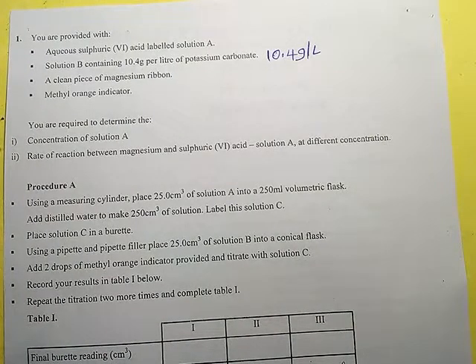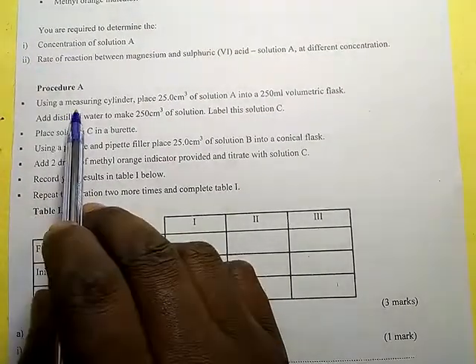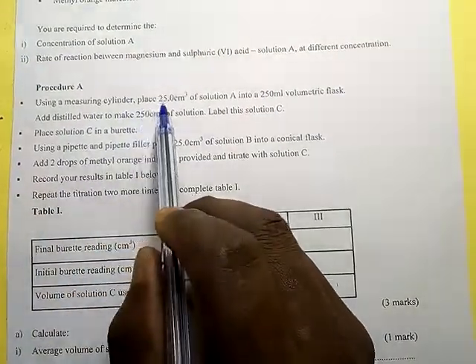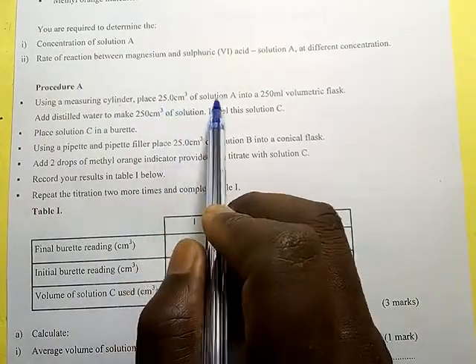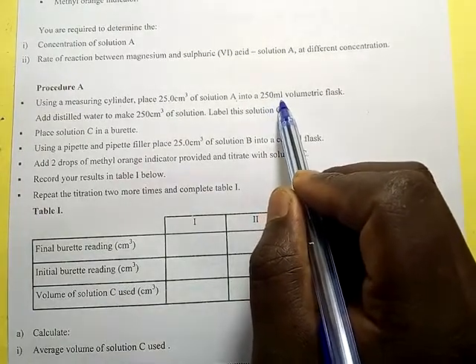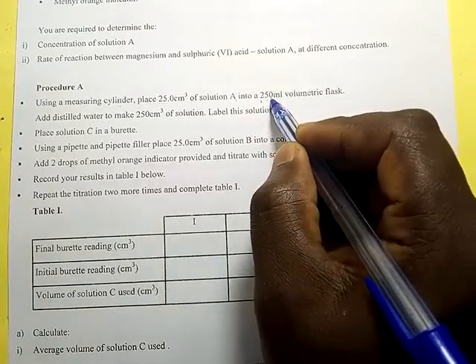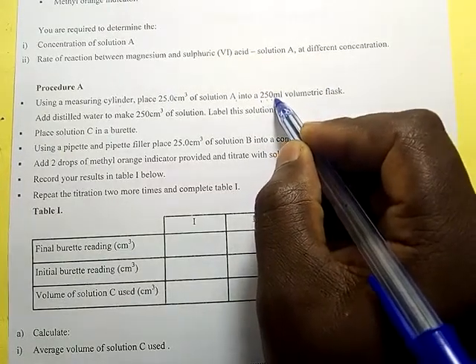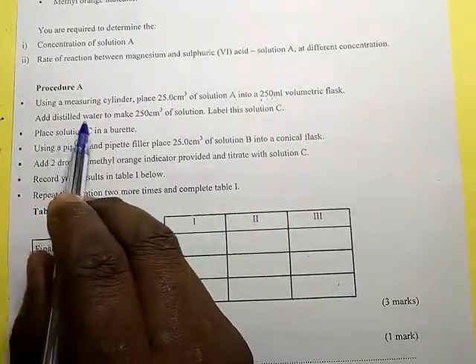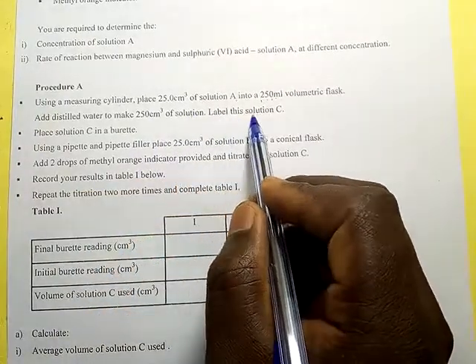A clean piece of magnesium ribbon, and methyl orange indicator. You are required to determine the concentration of solution A. Let us go to procedure A. Using a measuring cylinder, place 25 centimeters cube of solution A into a 250 milliliter volumetric flask. Actually, remember that 250 milliliter equals 250 centimeters cube. Add distilled water to make 250 centimeters cube of solution, labeled solution C.